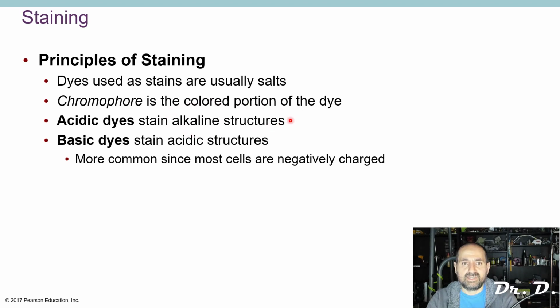Structures in the cell that have a positive charge. Did you guys follow that? The acidic dye is a negatively charged dye. They stain alkaline structures. Here's something I want you to understand. This will help you so much in the future. This was something that took me a while to understand back in college.